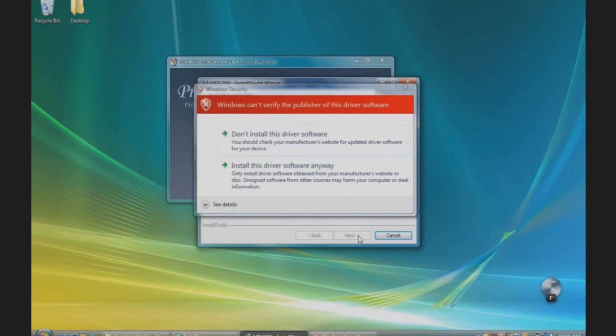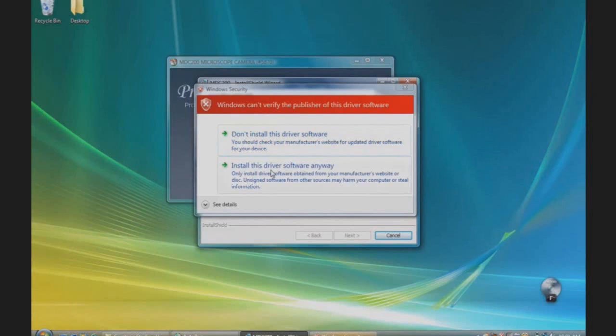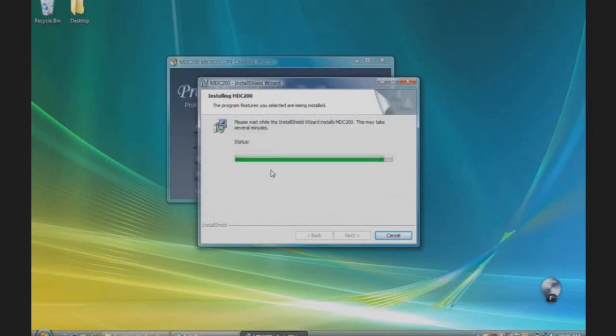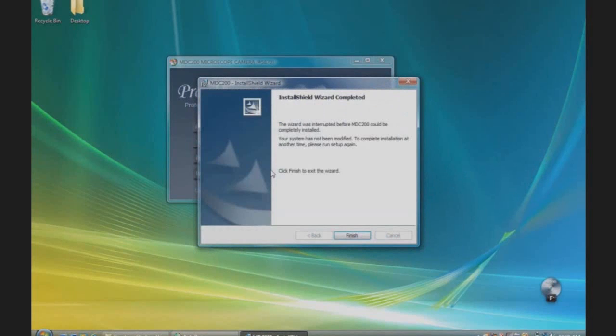If a message appears stating Windows cannot verify the publisher of this driver, select Install This Driver Software Anyway. When it is complete, select Finish.